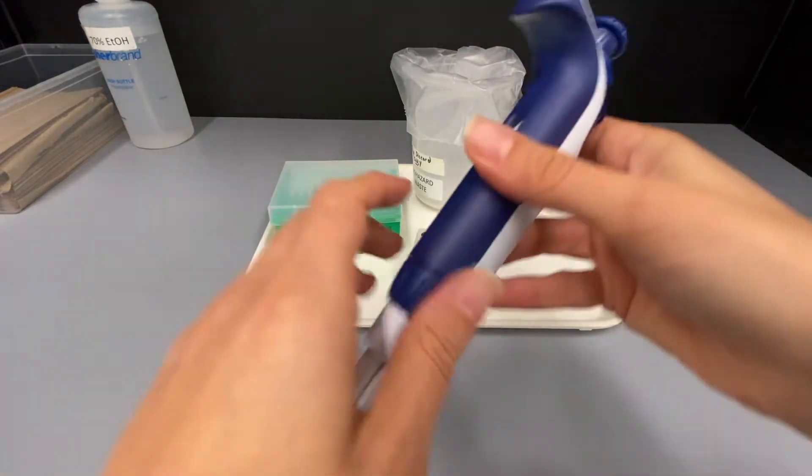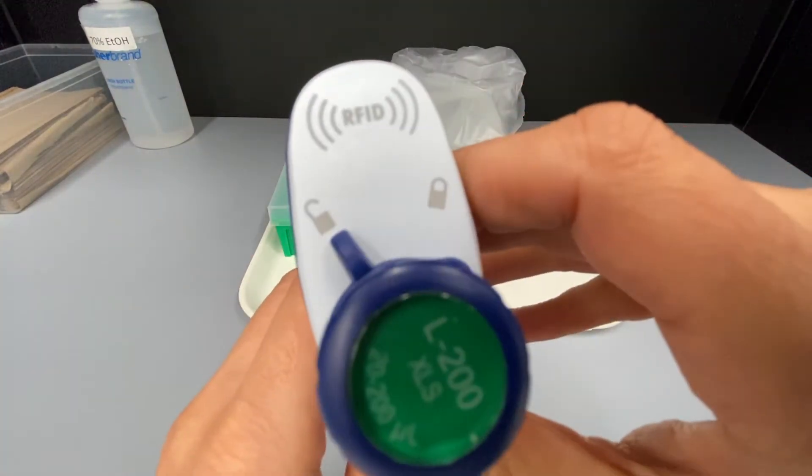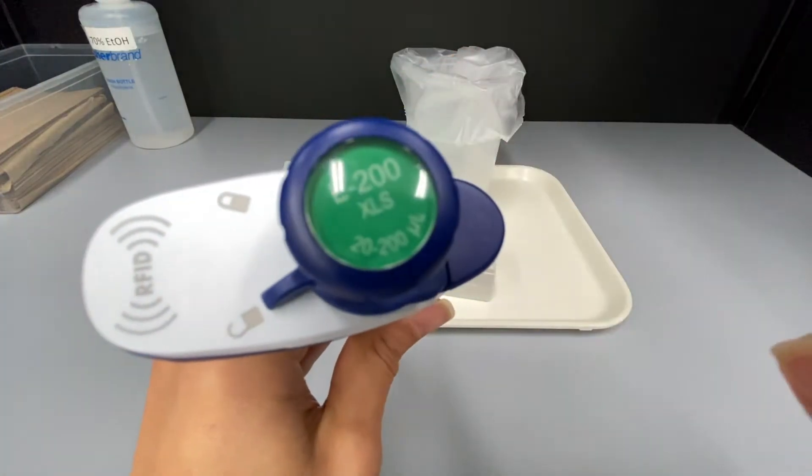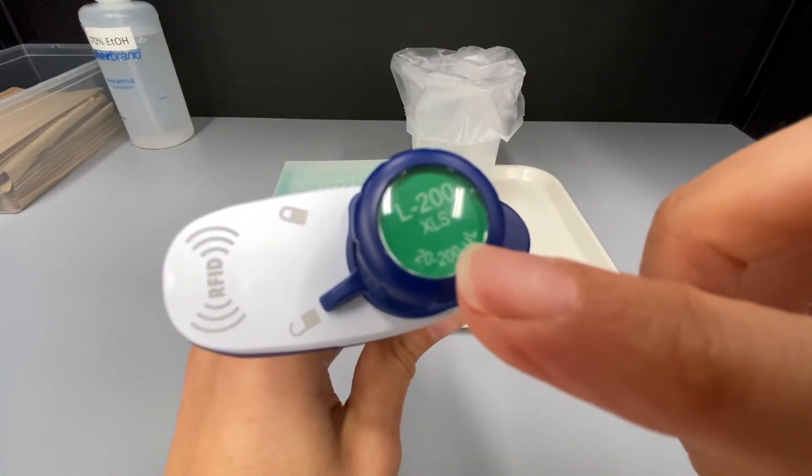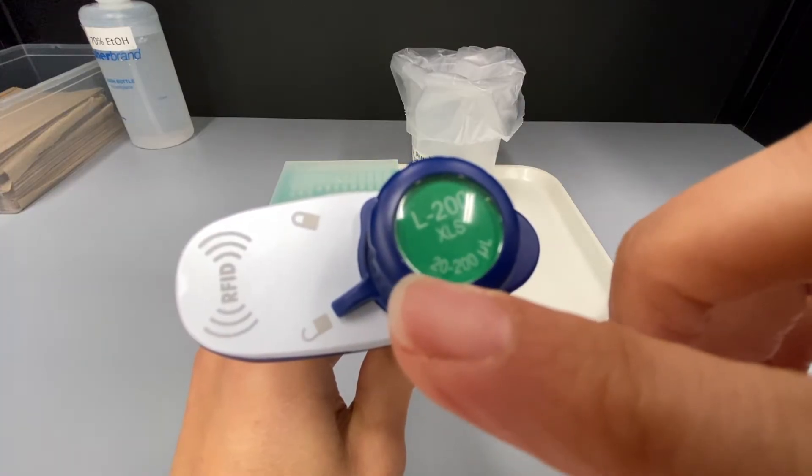This is a P200. The 200 refers to the maximum volume of solution that the micropipette can transfer. There is also a minimum volume associated with the pipettes. For the P200, it's 20 microliters.